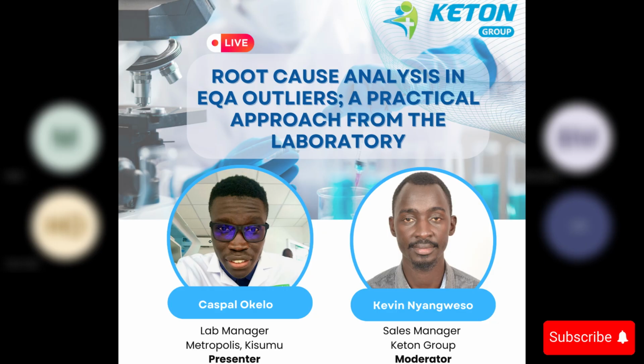That link will give you the accreditation certificate, the scope of accreditation, the calendar, the catalog. We also have a troubleshooting guide and a report interpretation guide on the same website. So in case you are enrolled in our EQA programs, you will see a step-by-step guide to interpretation and to troubleshooting of EQA outliers, so that it's quite explained.